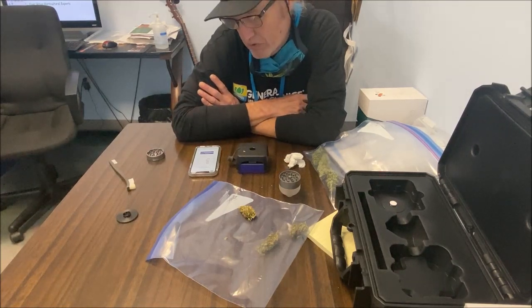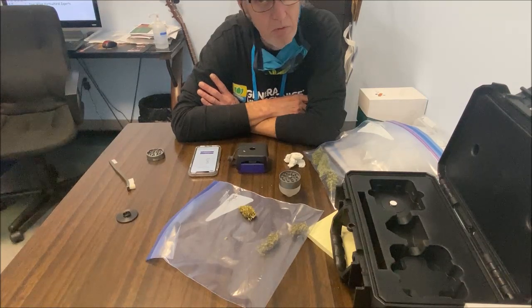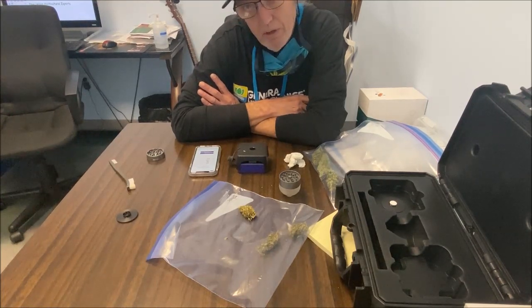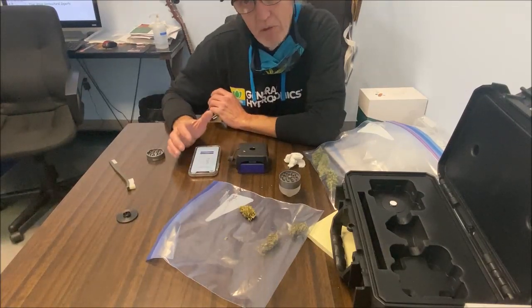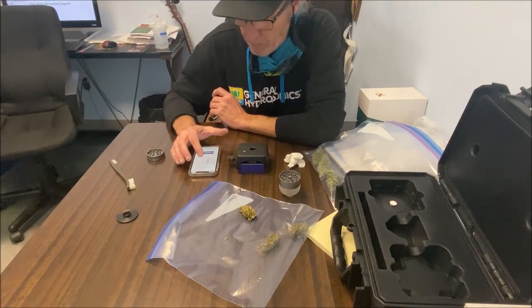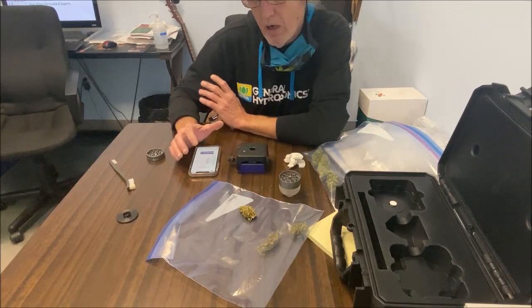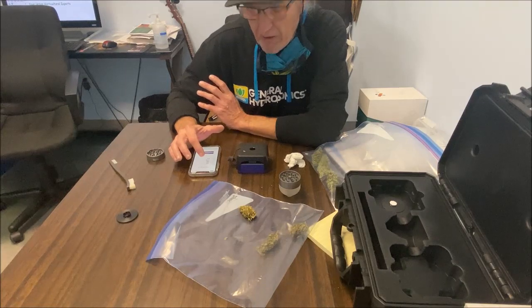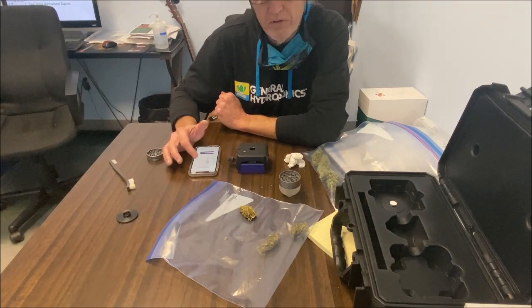It's a little bit confusing because the mother was a straight THC plant that tested out above 20%. So the wild card, I guess, is the pollen that I put on there to make these seeds. And obviously that pollen must have been a CBD strain. But that 6% THC and 9% CBD is a good number. I'm happy to have that CBD and on a strain that will also get you high, because you will get a high, you will feel this 6%.